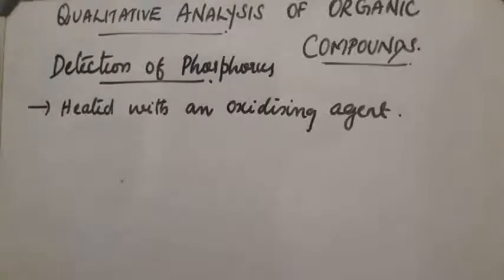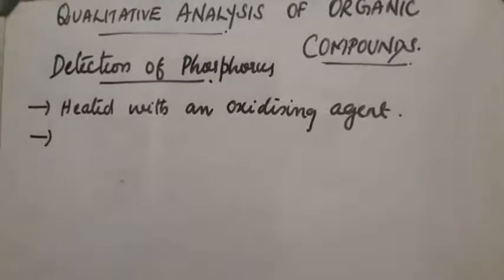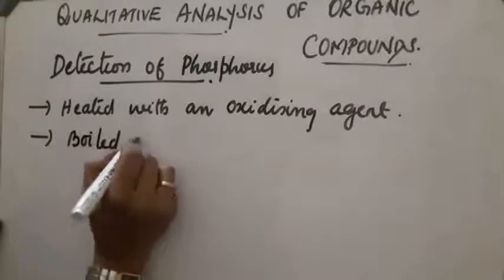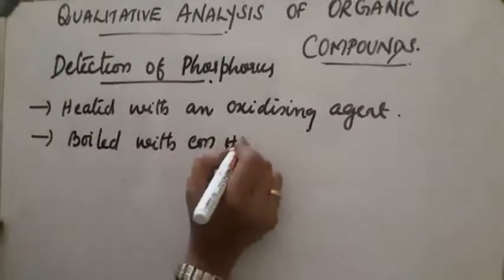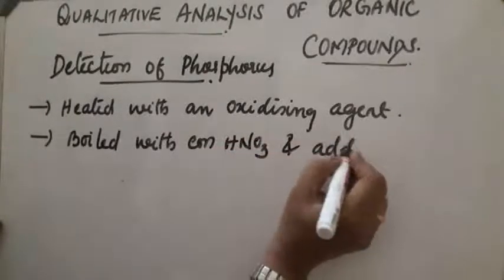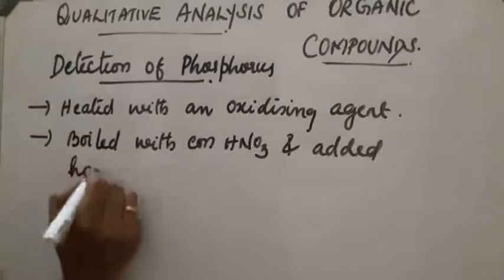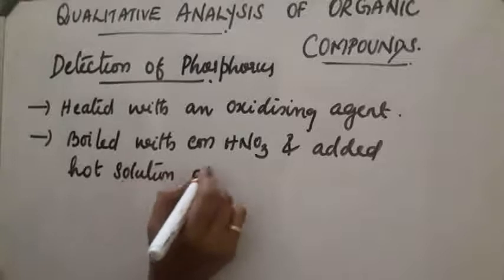The residue is extracted with water and boiled with concentrated nitric acid, and then hot ammonium molybdate solution is added.